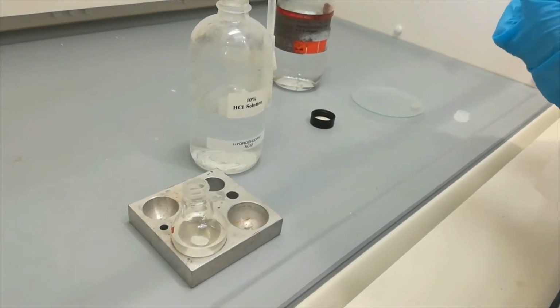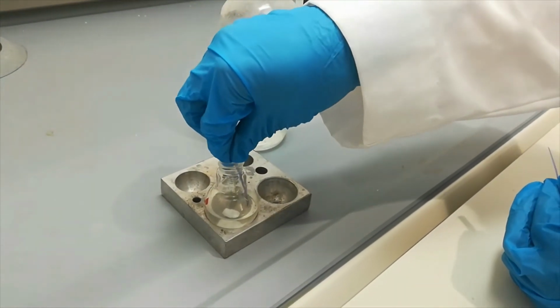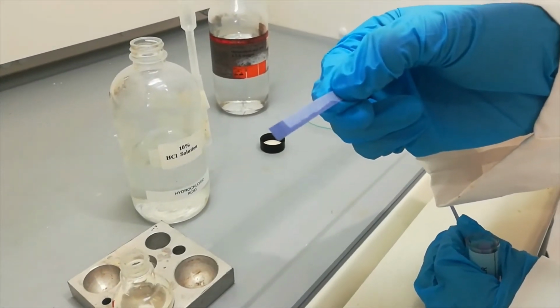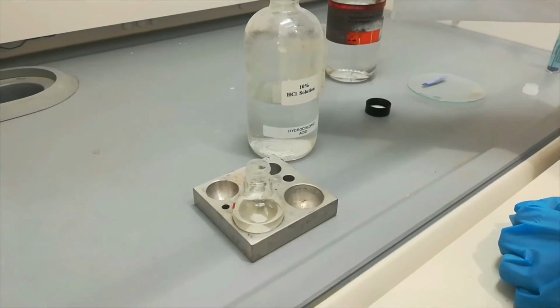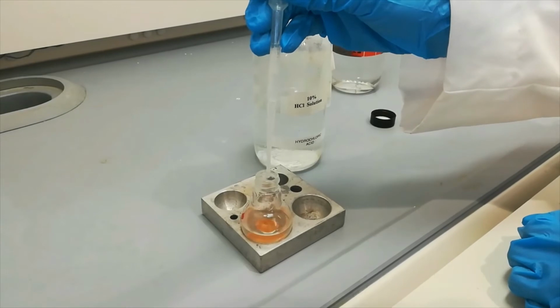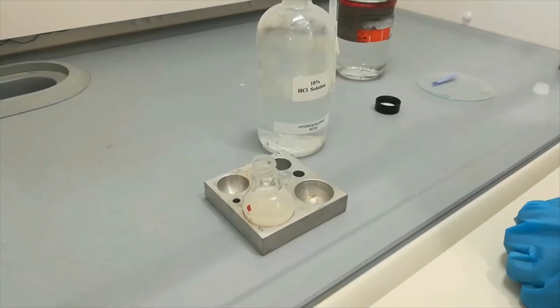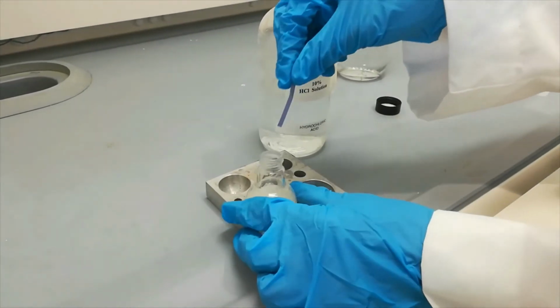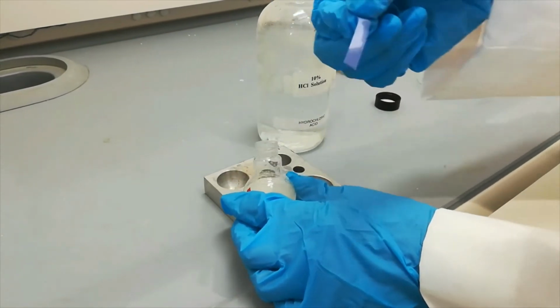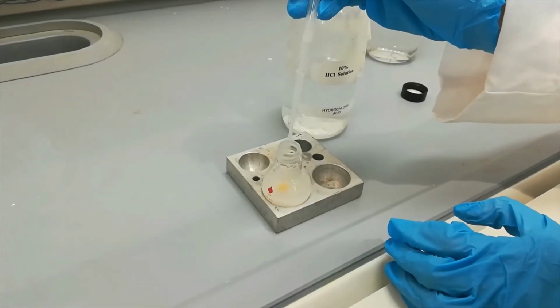So if everyone remembers correctly, litmus paper turns from blue to red or pink in the presence of an acid. After one initial dip, you can see that the paper is blue. That means the solution is still alkaline. So more addition of hydrochloric acid, followed by swirling of the flask, and more intermittent checking with the litmus paper. We keep doing this until the solution is just acidic. The litmus paper is still blue, which means we need more addition.